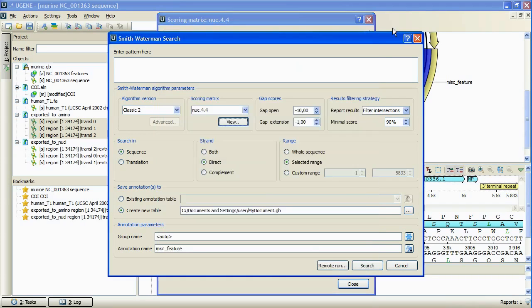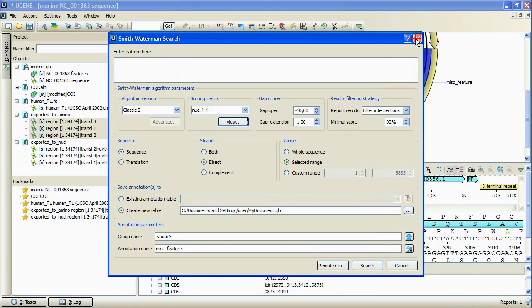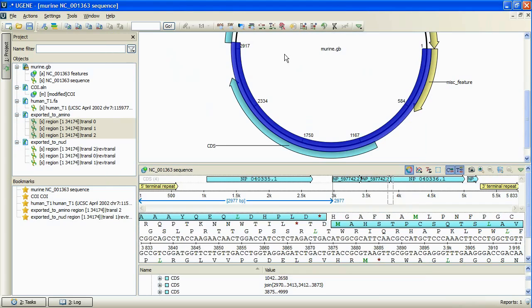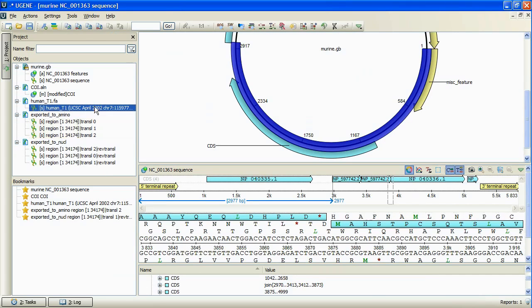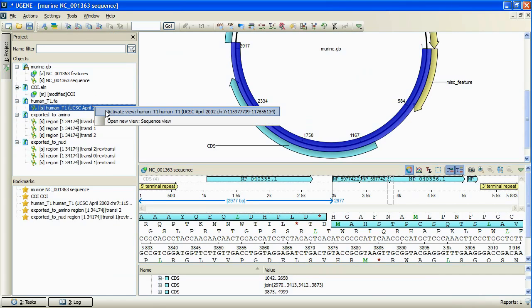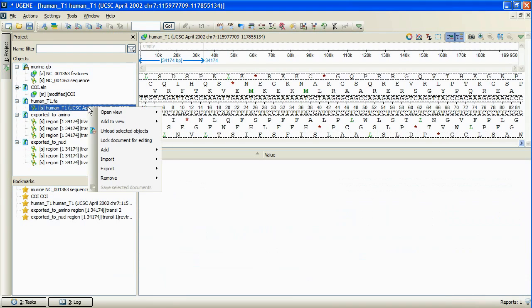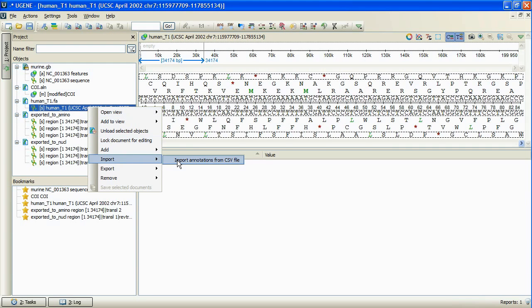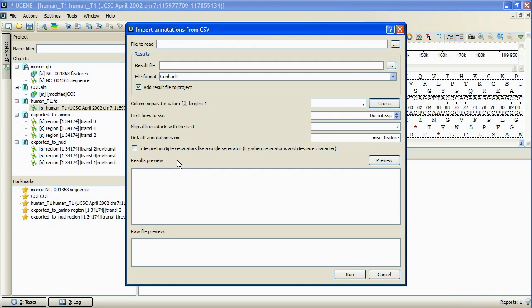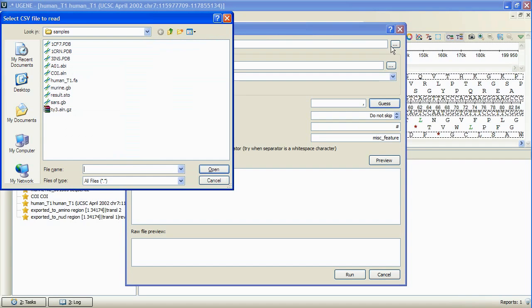Another feature we would like to talk about is importing sequence annotations from the CSV comma separated values file. To do so, we right click at the sequence item within the current project view, and select import, import annotations from CSV file. In the dialog box, we specify the file to read annotations from.